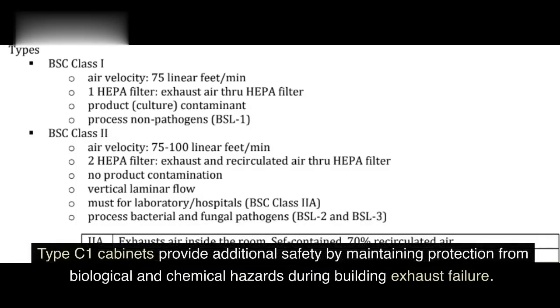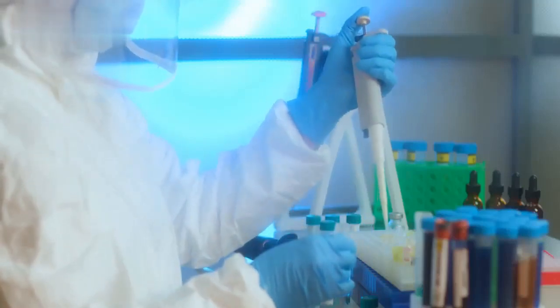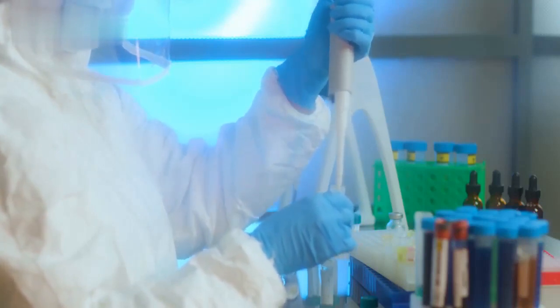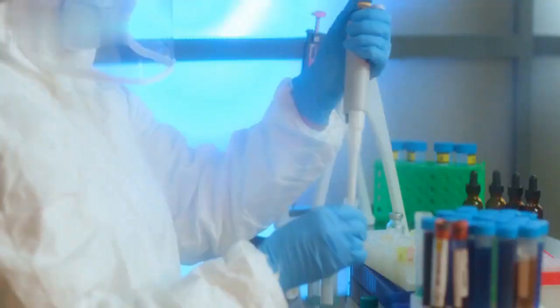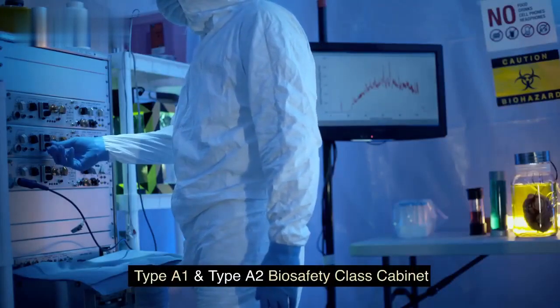Type C1 cabinets provide additional safety by maintaining protection from biological and chemical hazards during building exhaust failure. Like Class 1 cabinets, Class 2 cabinets are safe for work using agents requiring biosafety level 1, 2, 3, or 4 containment.